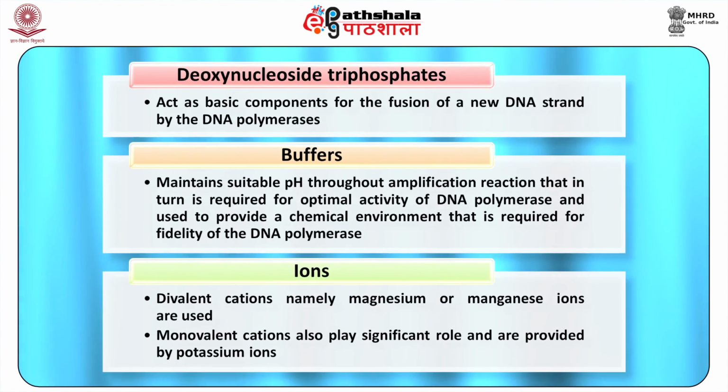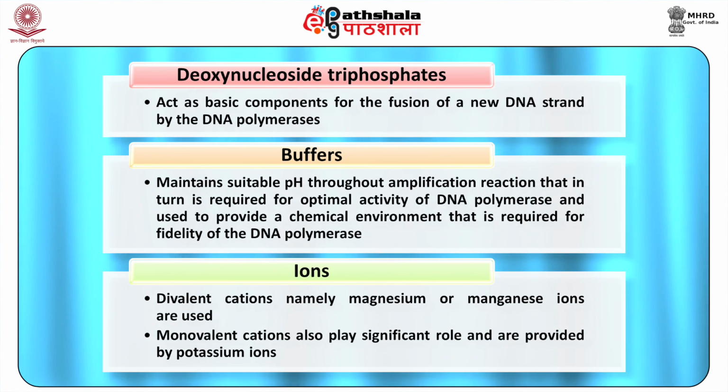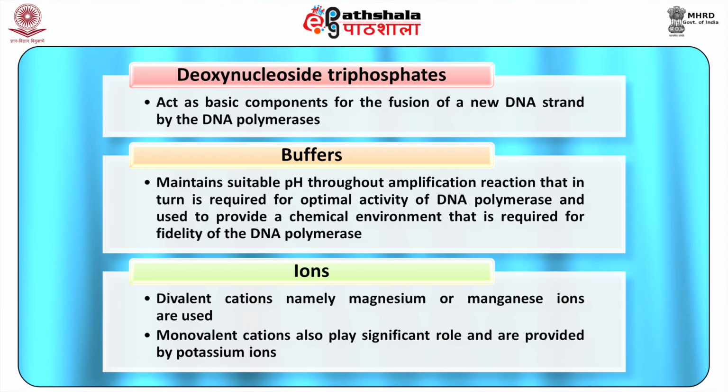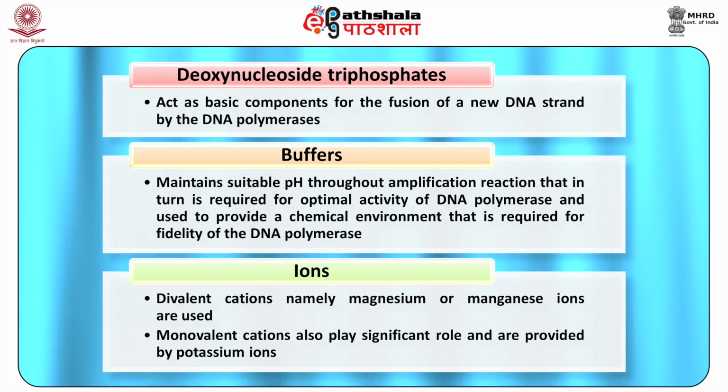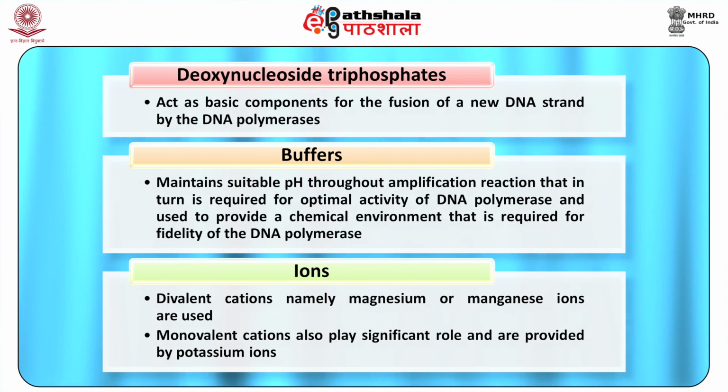Deoxynucleoside triphosphates. These are commonly called the dNTPs, which act as the basic component for the synthesis of a new DNA strand by the DNA polymerases. These include dATP, dGTP, dCTP and dTTP.